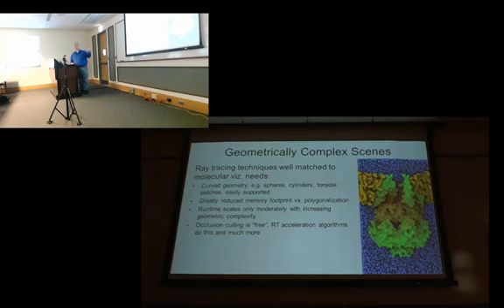And one of the things you're trading off then is ray tracing requires more computation than rasterization OpenGL does. But you get these high quality images, and the best part is you don't have to spend as much of your time fiddling around with parameters. It will look good mostly by default if you use a lot of the defaults we have set. And I'll show you a little bit about how that works.